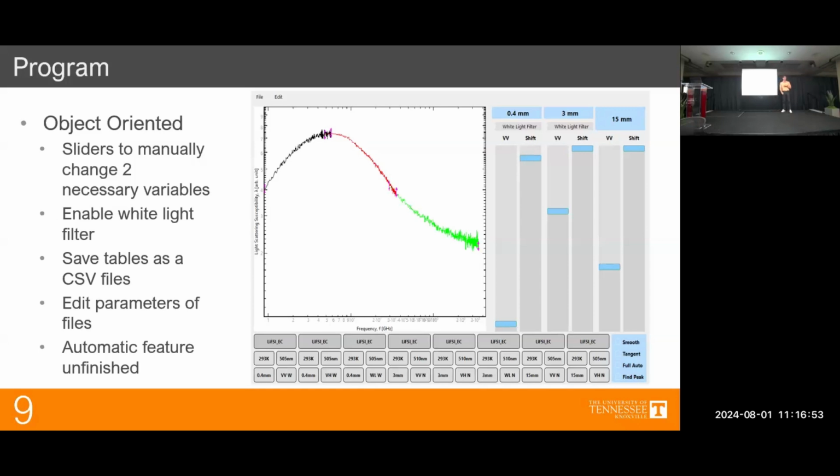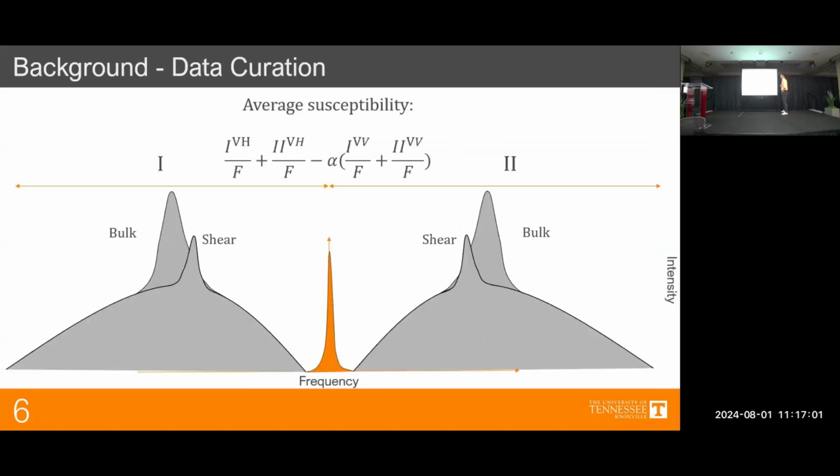Yeah, thanks. Is there any physics in the width of the peak? In terms of the physics of the width of the peak, this might be better to look at. The whole idea is that the width of the peak is the relaxation time. As I said, it might be better to look right here. The whole idea is that this is how long it takes the molecules to stop rotating. So the more liquid the material is, or the less viscous it is, the wider and taller the peak is. But if you look at a solid, for example, a solid's very static. Those materials don't spin very much. So the more solid and static a material is, the flatter this curve is.